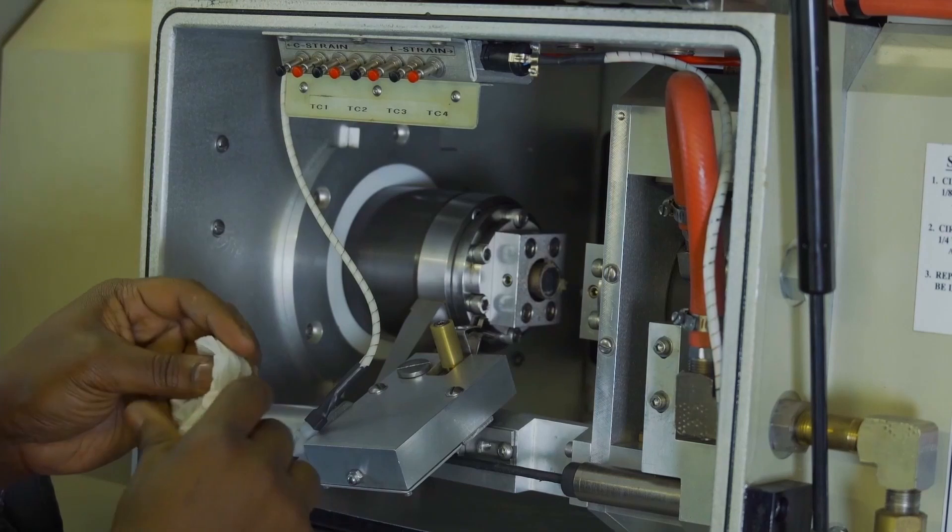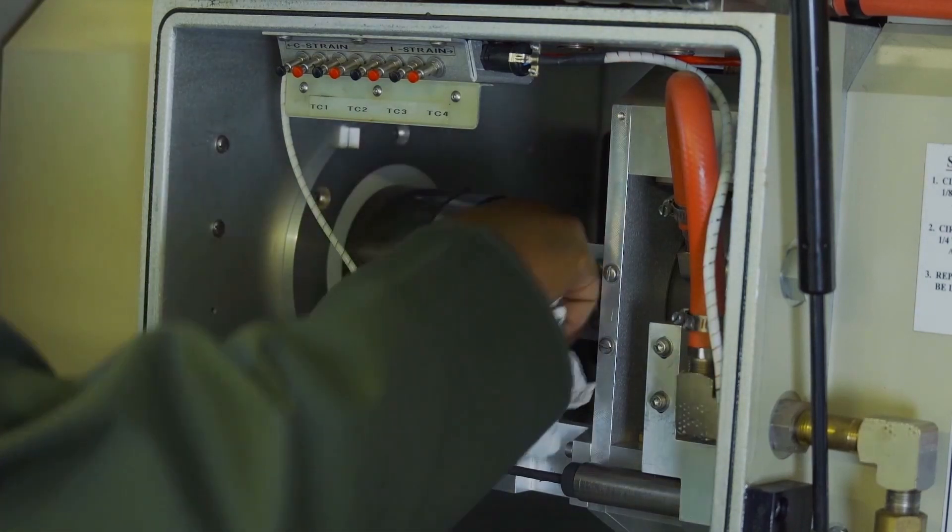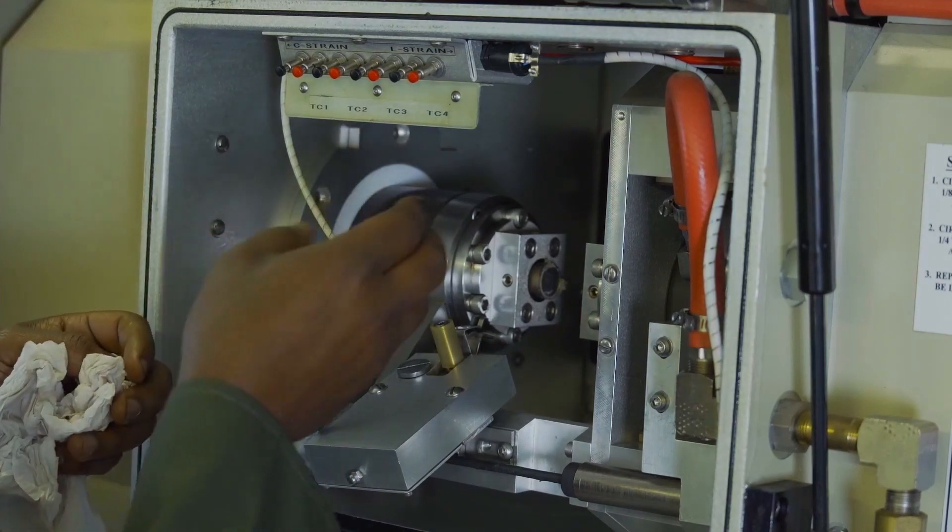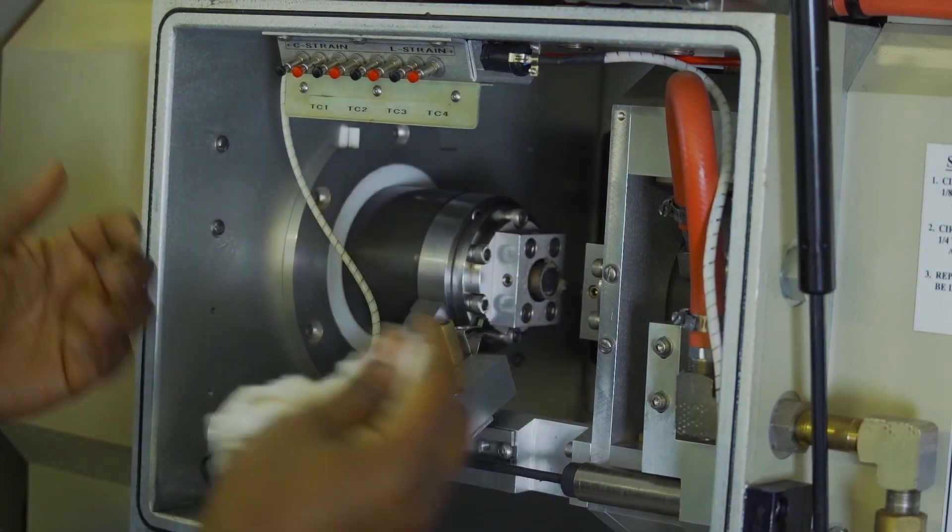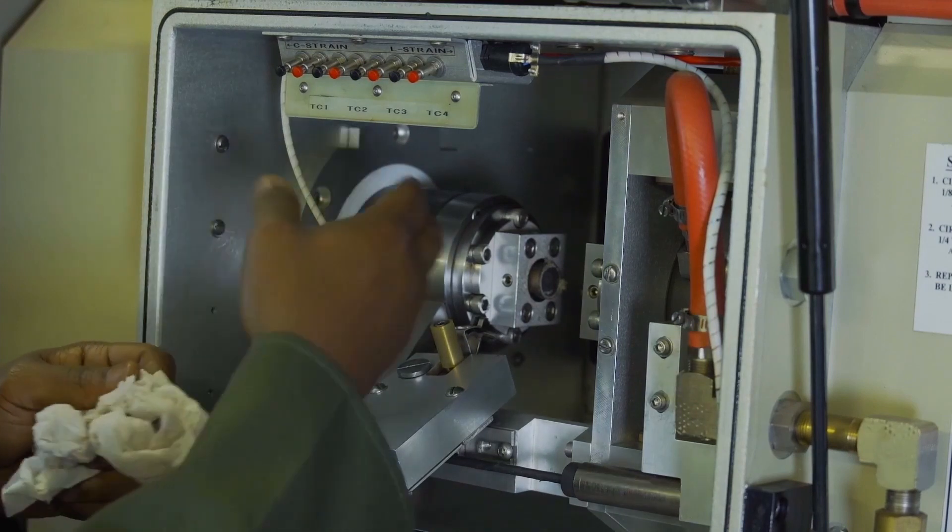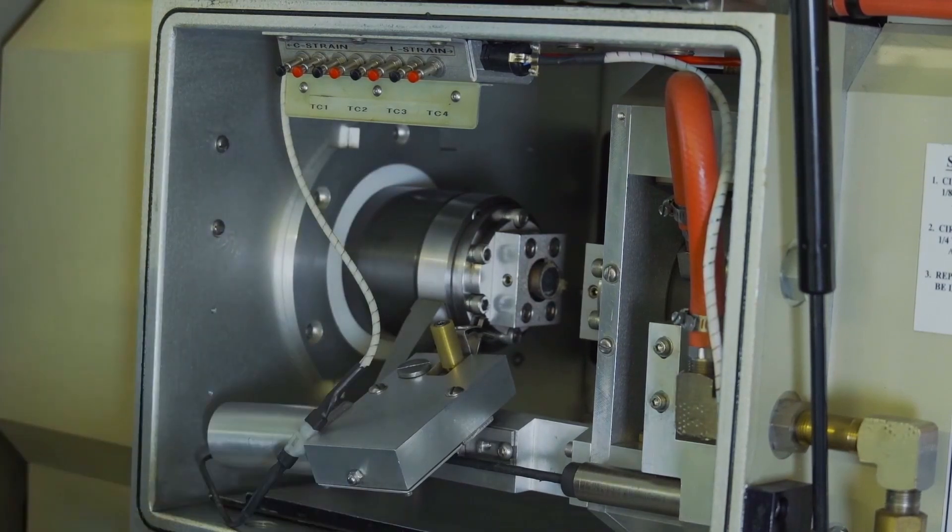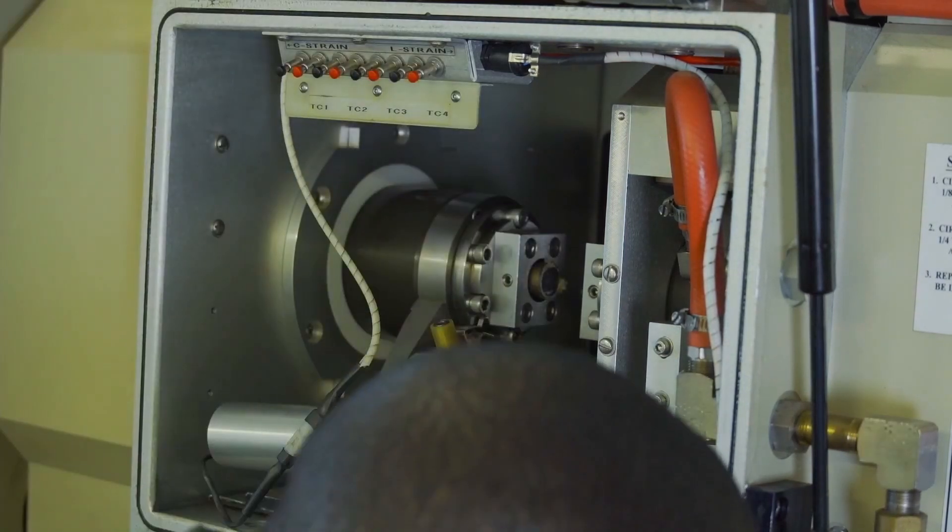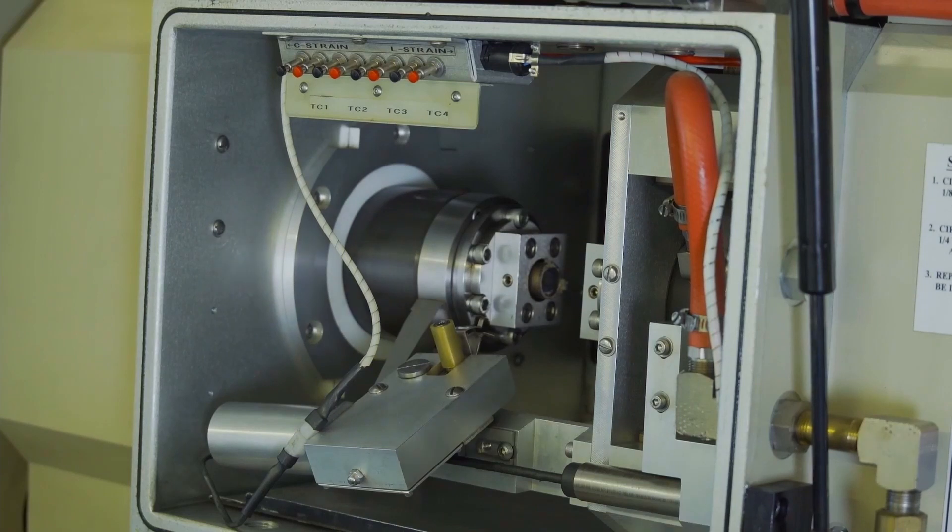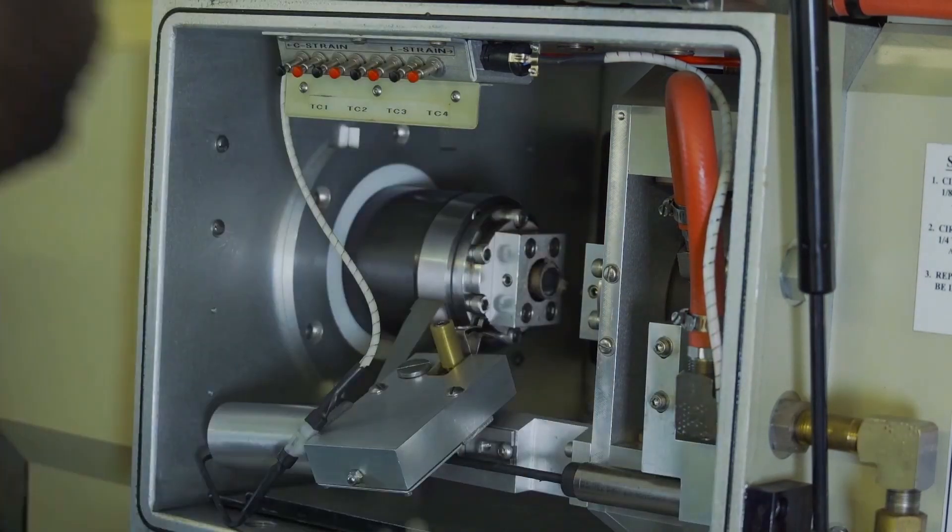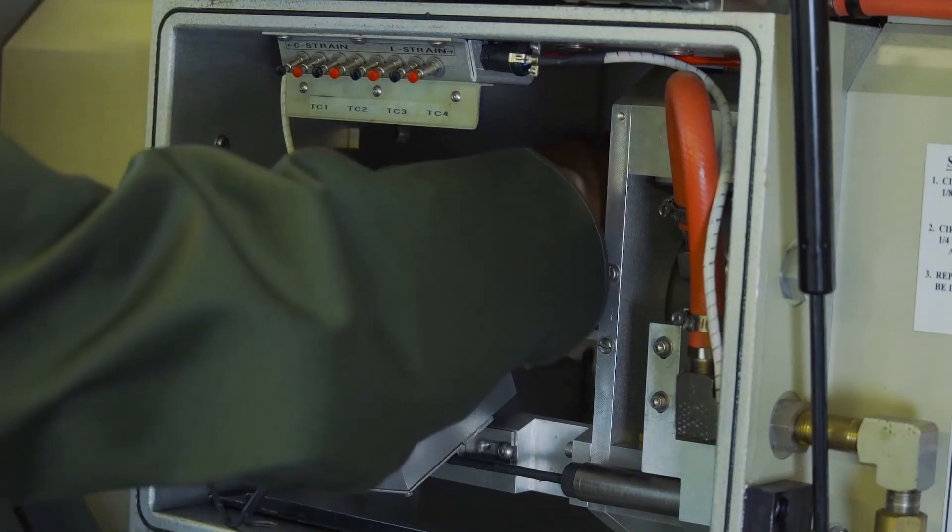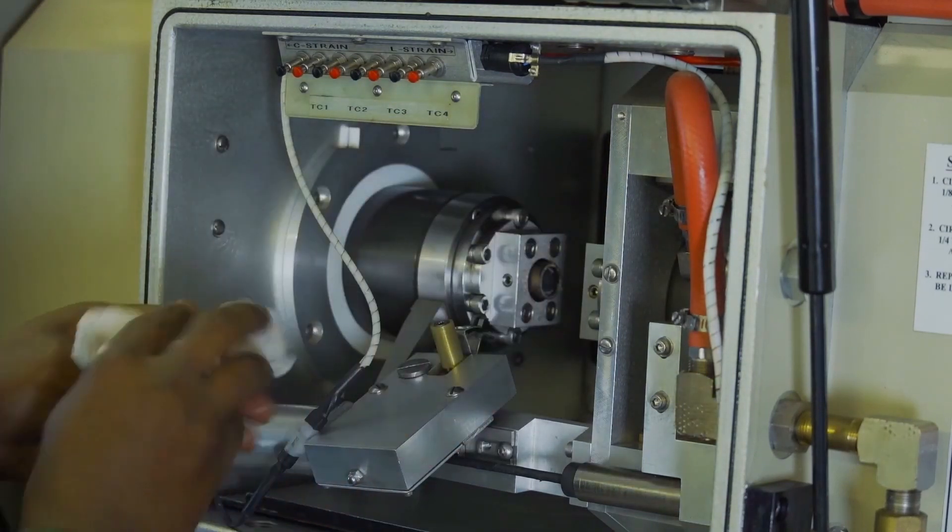In previous tests you might have some debris, dust, or even grease from the lubricants that you apply. So I like to clean with ethanol before I do the next thing. Just clean the anvils with ethanol and be sure that it's clean.